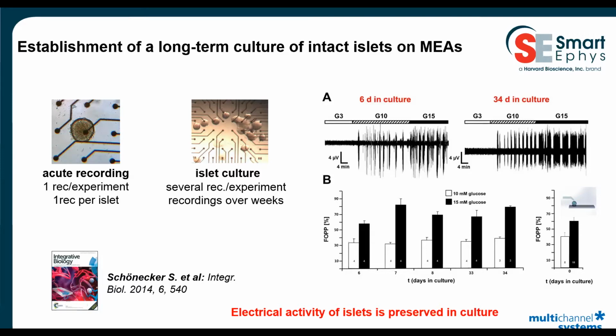And after the quantification of the data, which you can see here in B, it doesn't matter if you look on day 6 or day 7 or on day 33 or 34. So the electrical activity remains stable over a very long time.